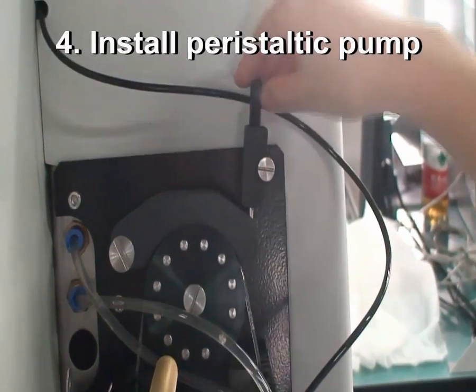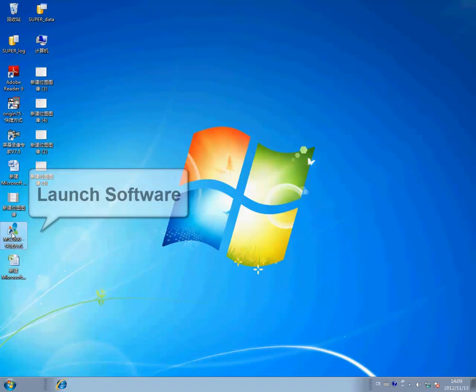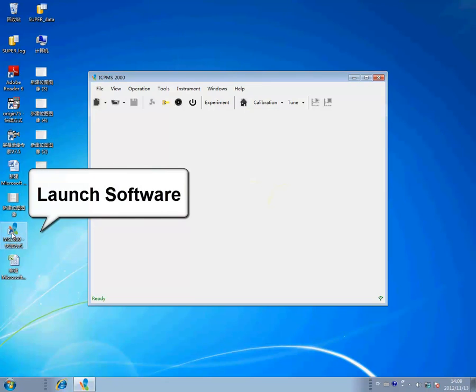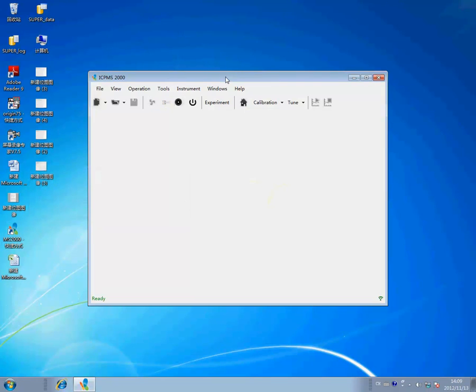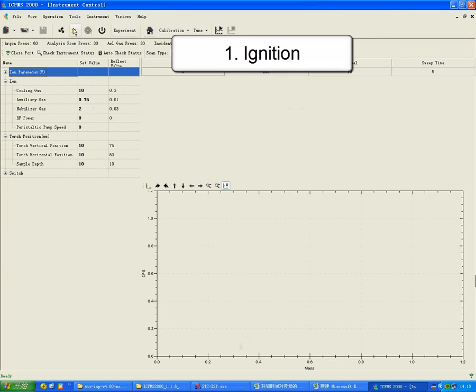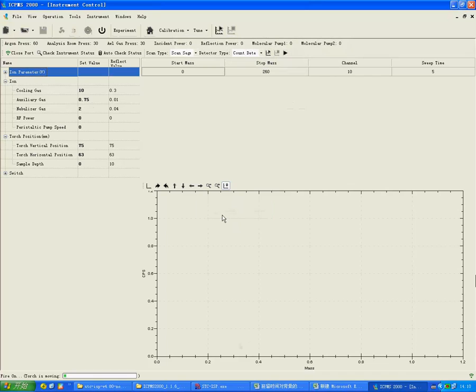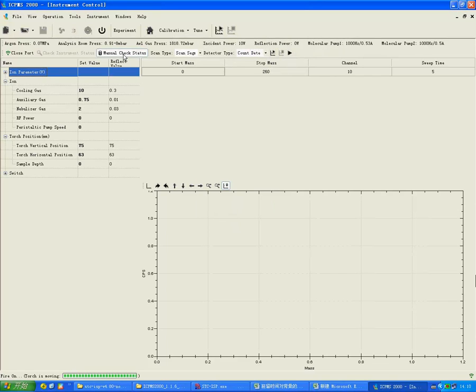Launch the software. First, click the ignition button. The software will ignite automatically. On the left bottom of the software interface, it indicates the procedures of ignition, such as torch moving, blowing argon gas, and so on.